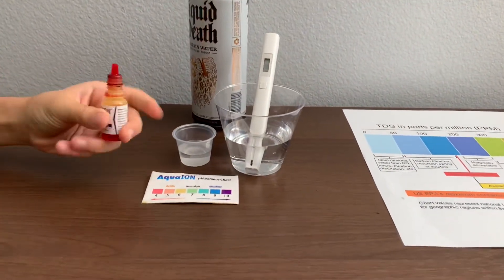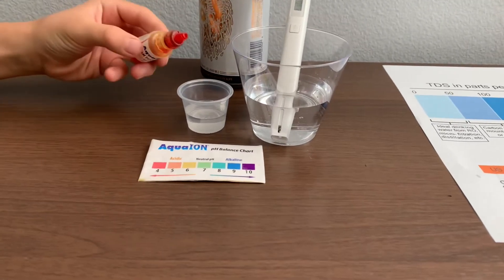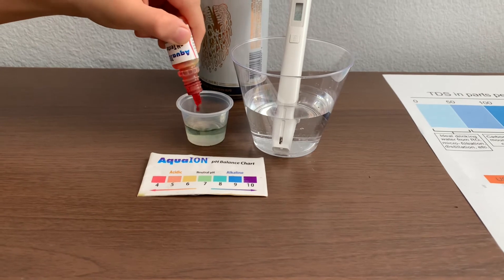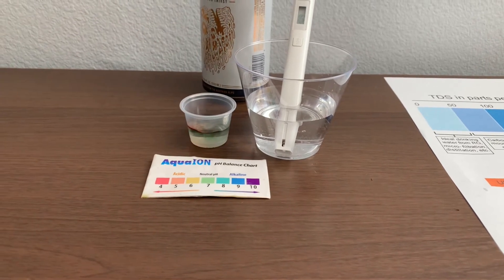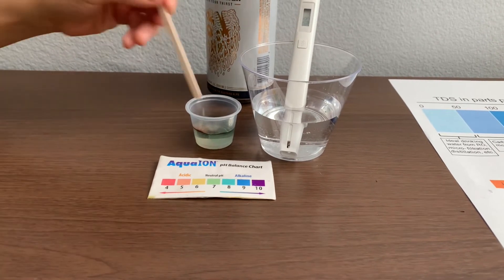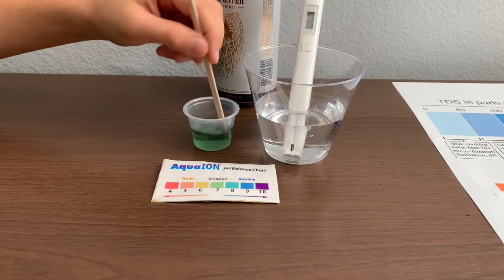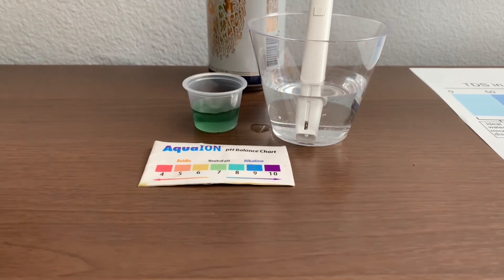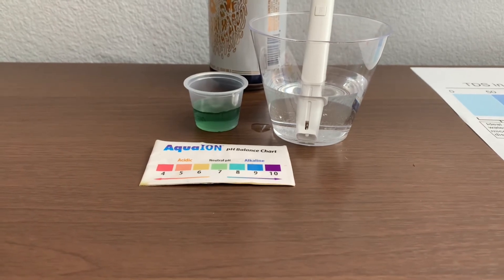Now let's test the pH level. Only do two drops. Let's stir it a little for a better result. I give this an 8. This is alkaline water.